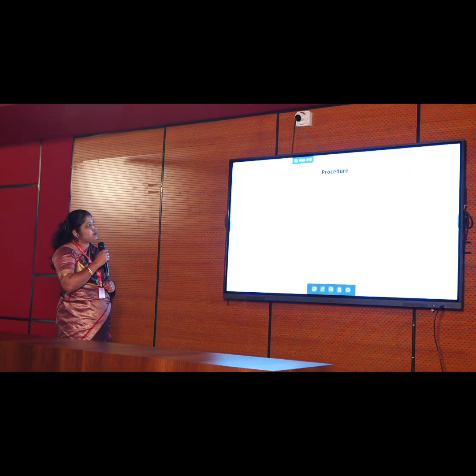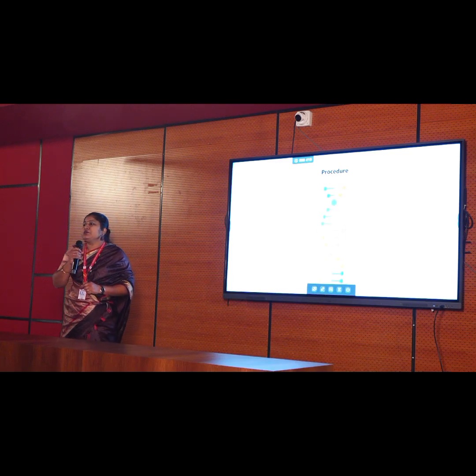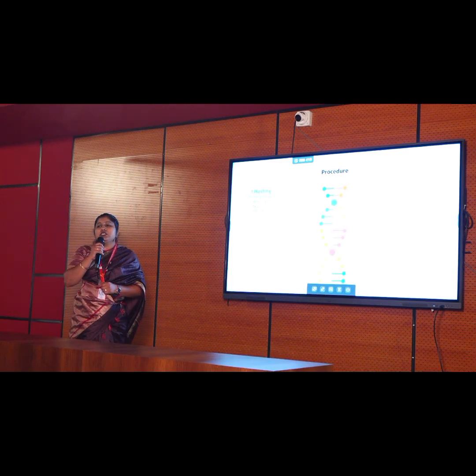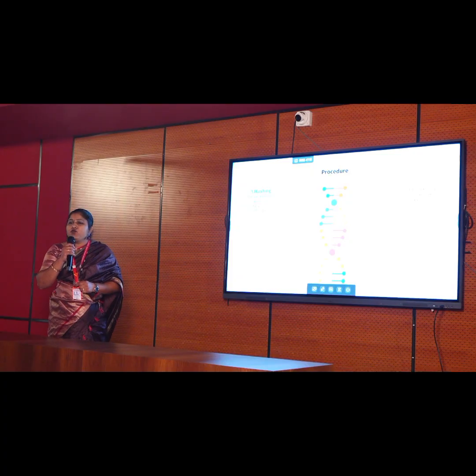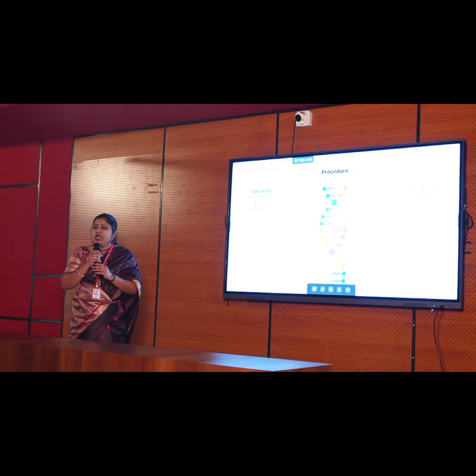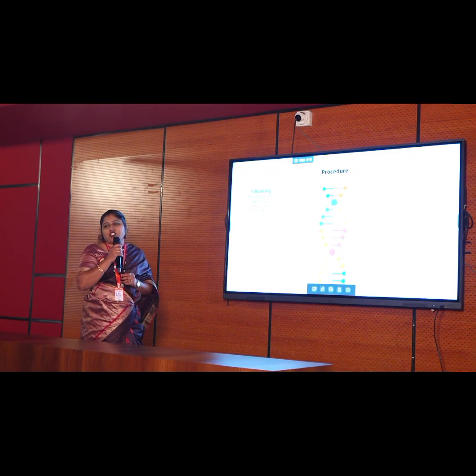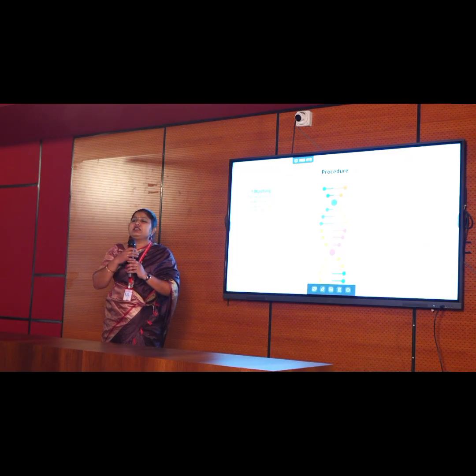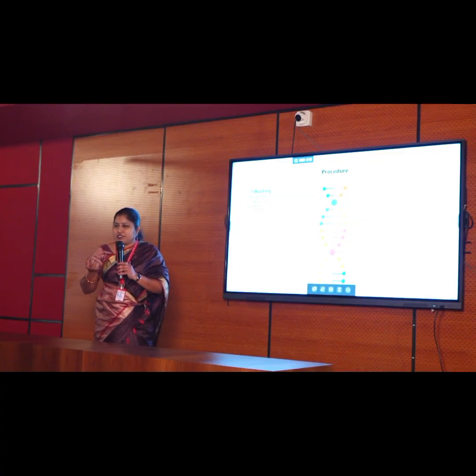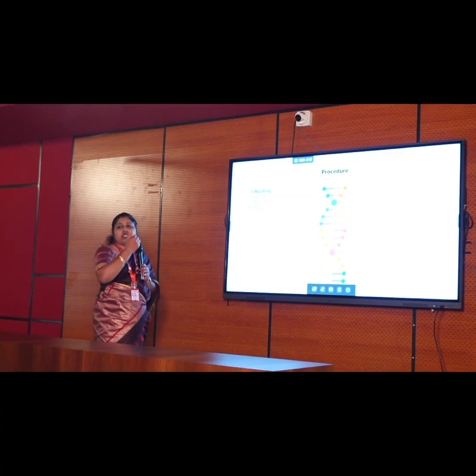Next. The procedure is very simple, just a 4-step procedure. First, we did mashing. We took the sample, washed it thoroughly, then mashed it using a mortar and pestle with water as a solvent. After that, second step, filtration. What is filtration? We filtered the extract so that we get the filtrate, where our DNA is present. After that, we took reagents.